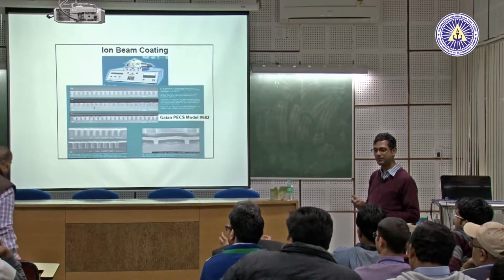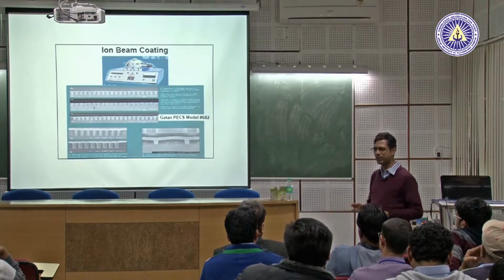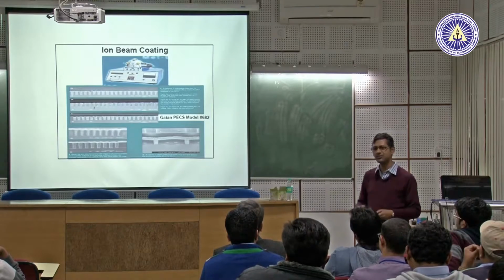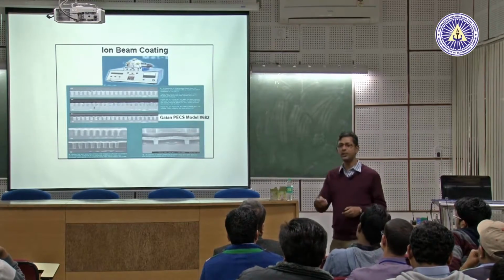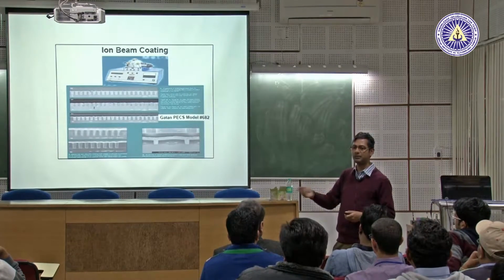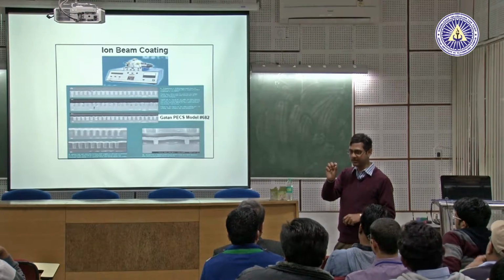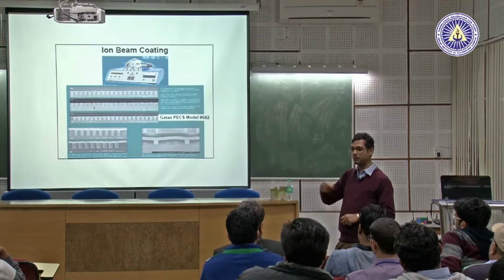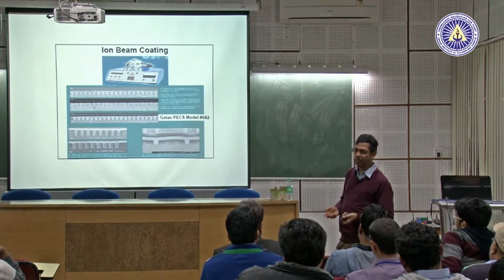You need to generate vacuum? Yeah, you need to generate vacuum, but not high. A rotary pump can do that. These machines come with all the SEMs nowadays, almost all. Even if you don't have one, you can buy silver paste, which is available in the market, and apply the paste on the surface. The advantage with sputtering is that you can generate nanometer thick coatings, but by applying paste you cannot do that. It will be thicker, then you will lose some information out of that.